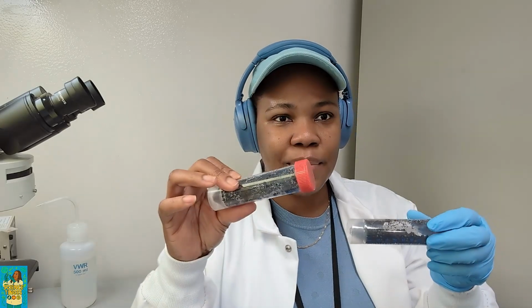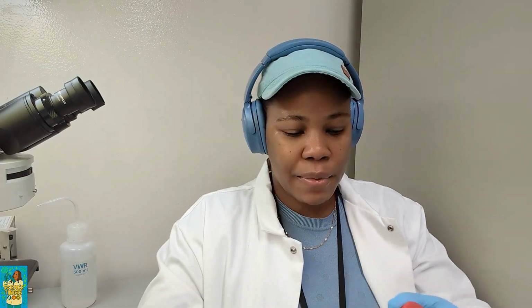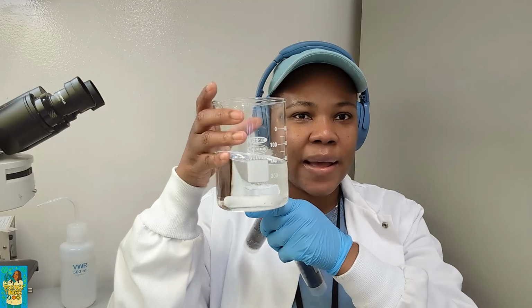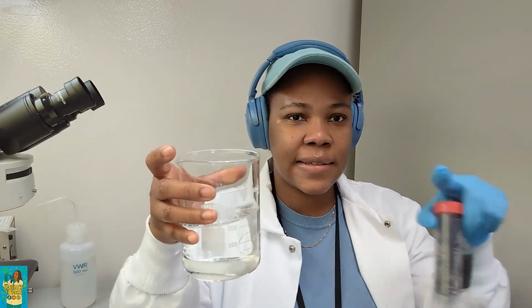And so I have my soil samples, and I'm going to put the different types that I got from different places, just to increase my chances of isolating the particular fungal strain that I want, in a beaker with water that has a stir bar. I'm going to let it stir for about 20 minutes just to get everything uniform. And once that's done, I'll take 1 milliliter, or ml, and carry out the serial dilution and plating step, which by now I've done so many times, but it is a common standard way of enumerating microbes.